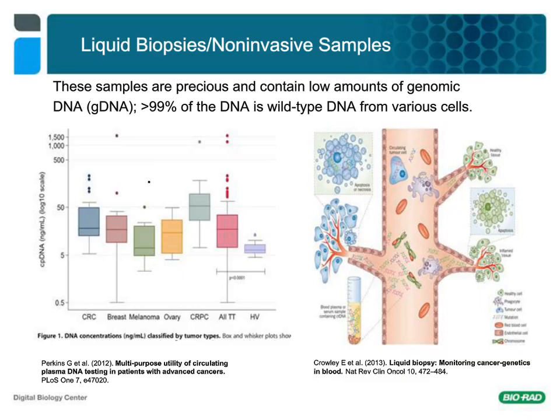Thank you, Chance. Yes, plasma seems to be the forerunner here, which is good since it's a liquid biopsy talk, which brings us nicely to our next slide. The liquid biopsy is the holy grail in diagnostics since it is largely non-invasive and believed to be more representative of the overall body rather than a biopsy of a tumor in a single location. In addition, multiple biopsies over time are considered impractical, expensive, and can be downright dangerous for the patient.